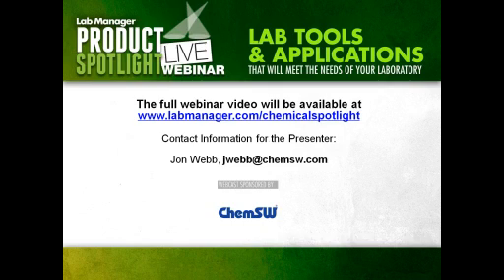I see. That's a really nice recommendation, but that also implies that you have a dedicated person who is in charge of chemical management in your lab. Sure. And if there's not a dedicated person, which, by the way, is our best practice recommendation of having dedicated personnel for managing chemical inventory.